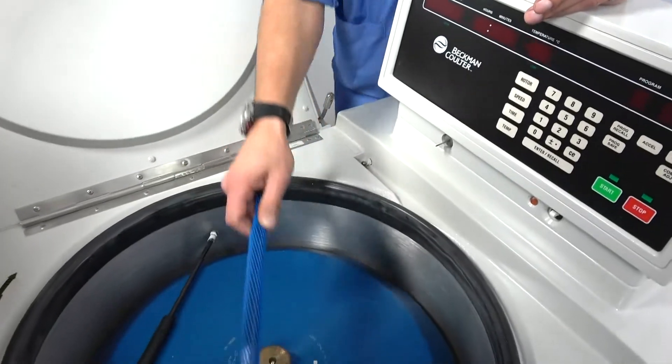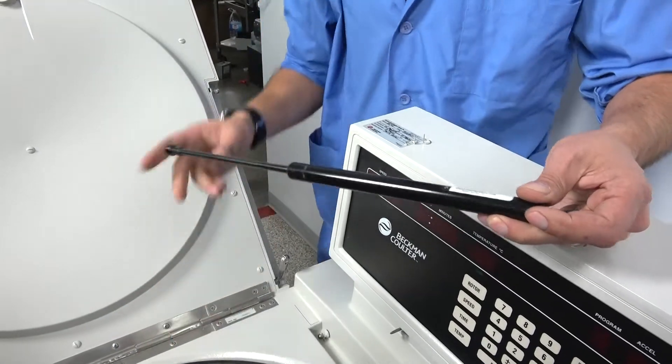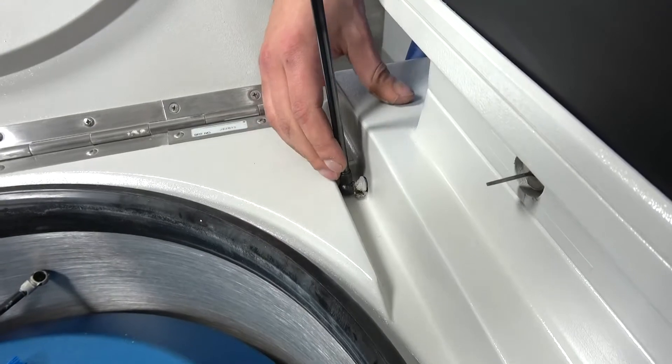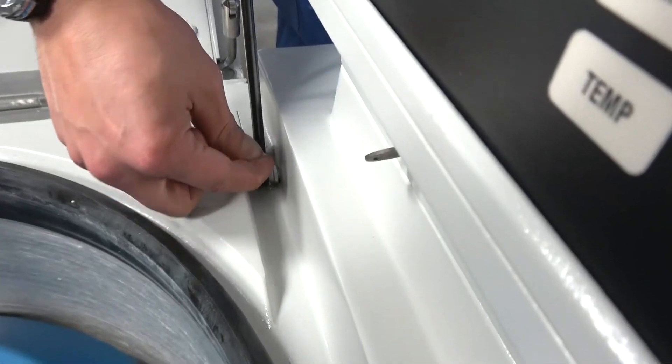We have a brand new one provided by Ozark Biomedical. You just pop it right onto the bottom, just like you took it off. When it clicks, then you know it's in. You can take your pin and you got to stick it right back in the hole.